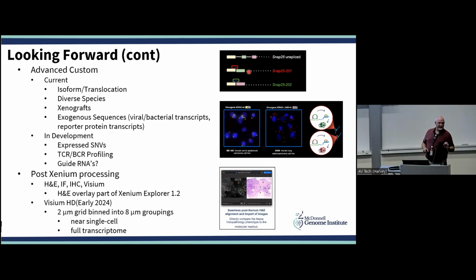The binding positions of the padlock arms are about 20 to 25 bases, they're sort of ambiguous about that. But you can use those to discern differences. So you see the splice variant here between the yellow-green and the yellow sort of fuchsia color there. So you can distinguish those.